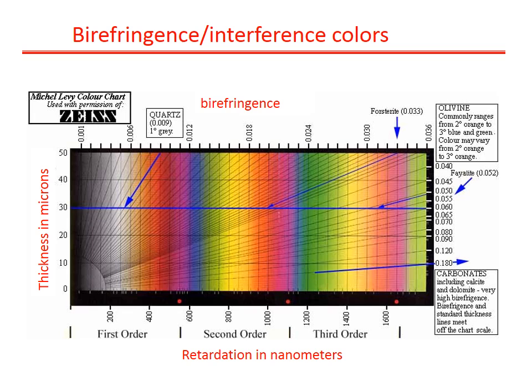And let's say that you have a thin section of standard 30 micron thickness for a rock containing the mineral olivine. If that mineral is pure magnesium olivine, it is forsterite. So that has a birefringence of 0.033, and it's marked with a blue arrow on the top of the diagram. So trace that diagonal blue line back to the arrow, along the arrow back to the 30 micron line, and you will see the retardation of 1,000 nanometers that is predicted, which corresponds to an interference color of second order orange.